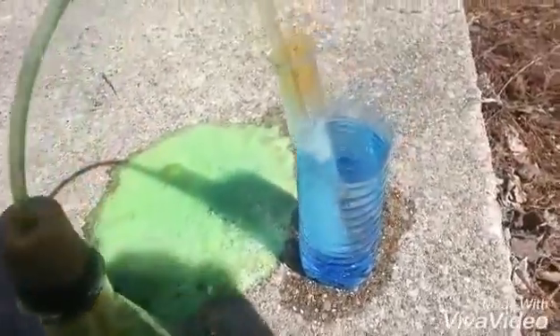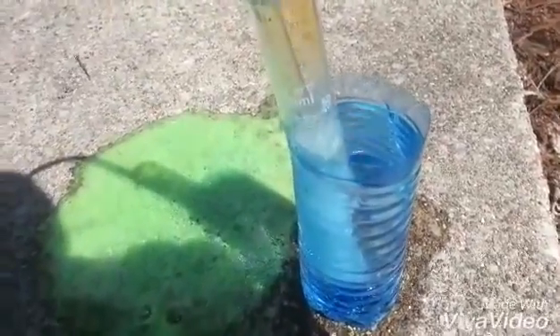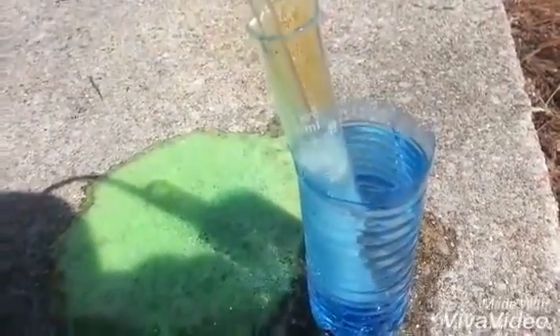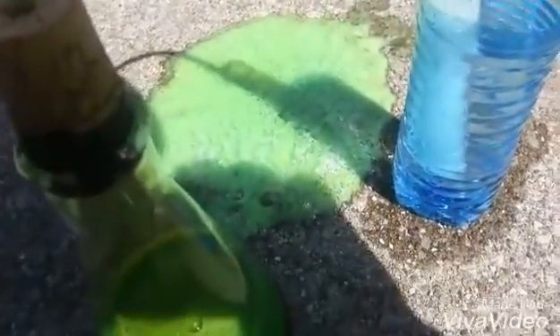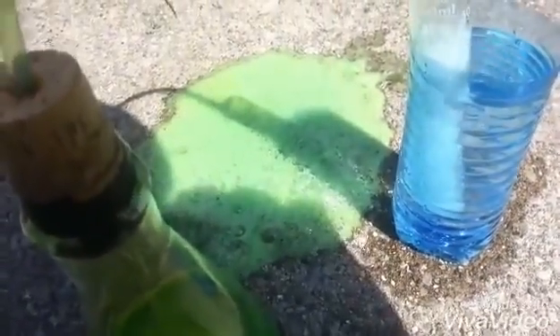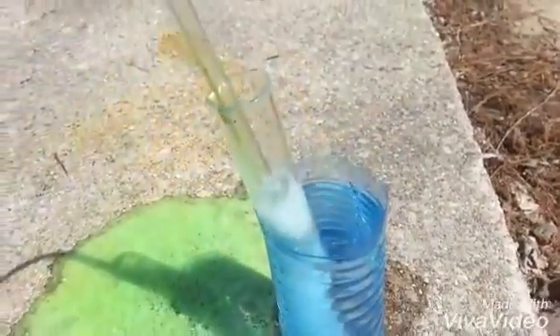As you can see, it foamed over right after I made that last little clip. I had to pull it out of the graduated cylinder because I didn't want it contaminated with hydrochloric acid. So I just let all the hydrochloric acid spit off onto the concrete, which I can clean up later with some sodium bicarbonate. But it seemed to have stopped foaming up so bad. So we're just going to let this keep running.